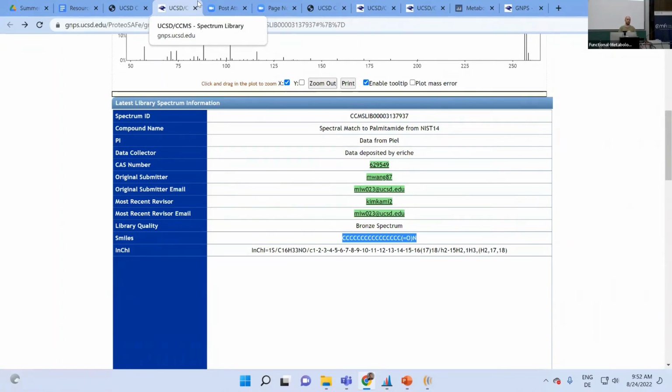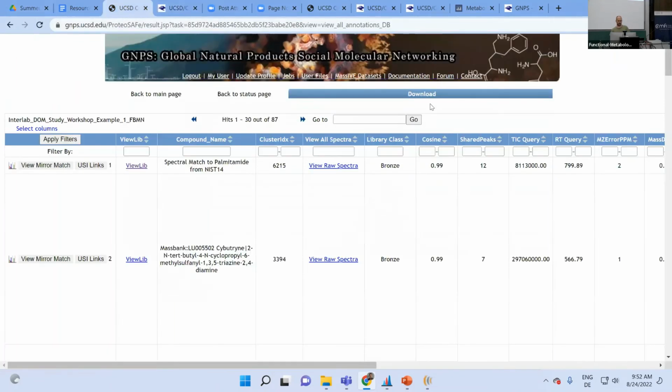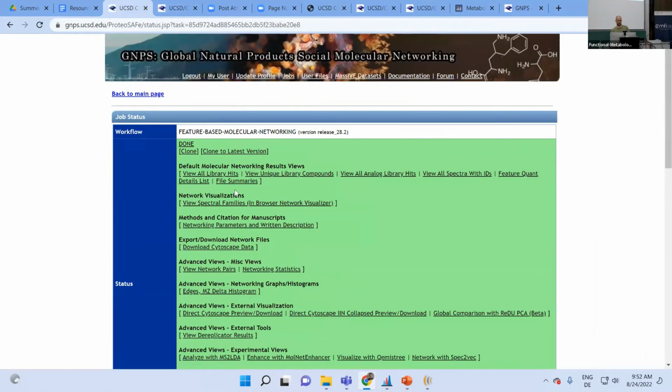And then if you have something that should be connected, you know there is, let's say, benzoylecgonine, which is a metabolite of it. You can test, okay, is this actually connected in the network? I go to the network view, or the cluster view, where I can look at all nodes in this network, then I would go to cocaine, open up the network view, and check: is it connected to the other compound that I know? So that's one way, but it does not apply to all chemical classes.